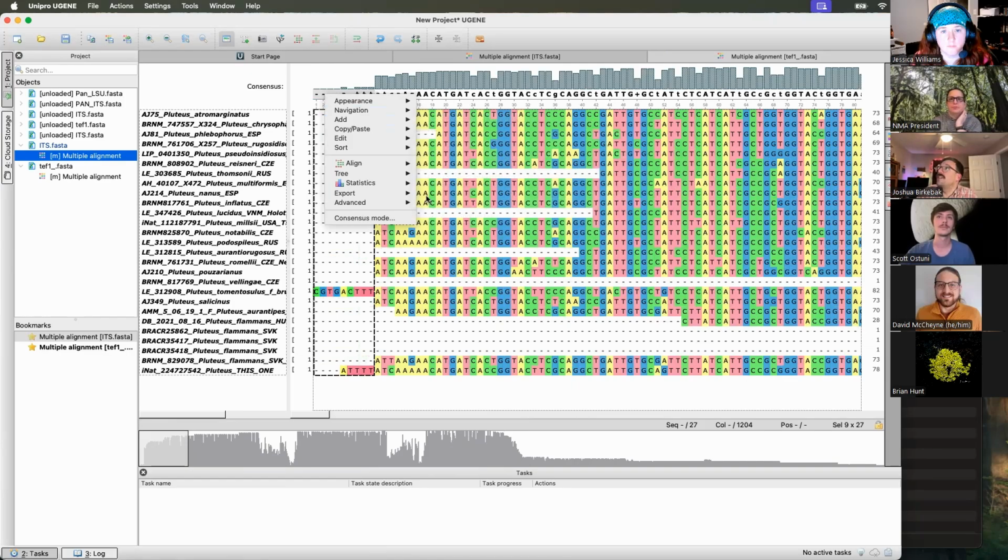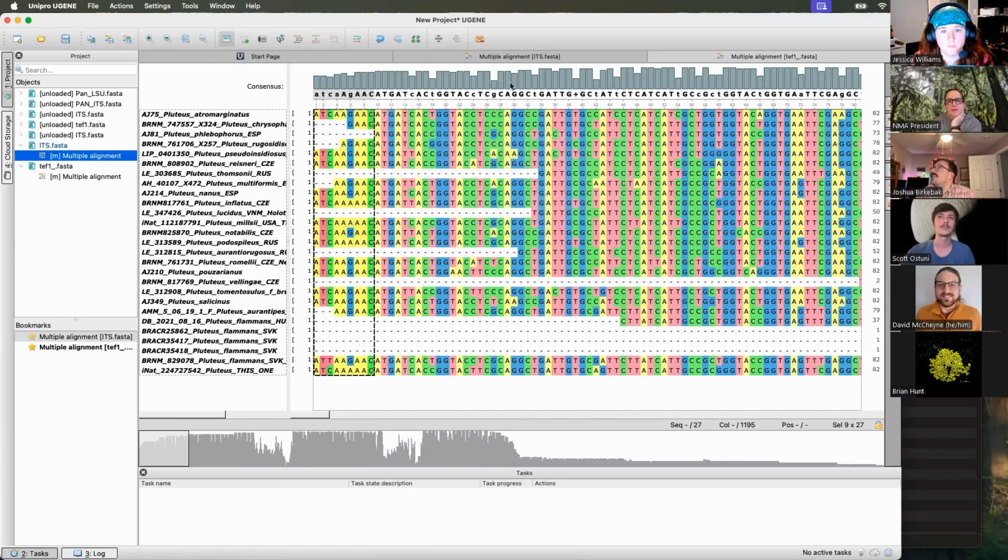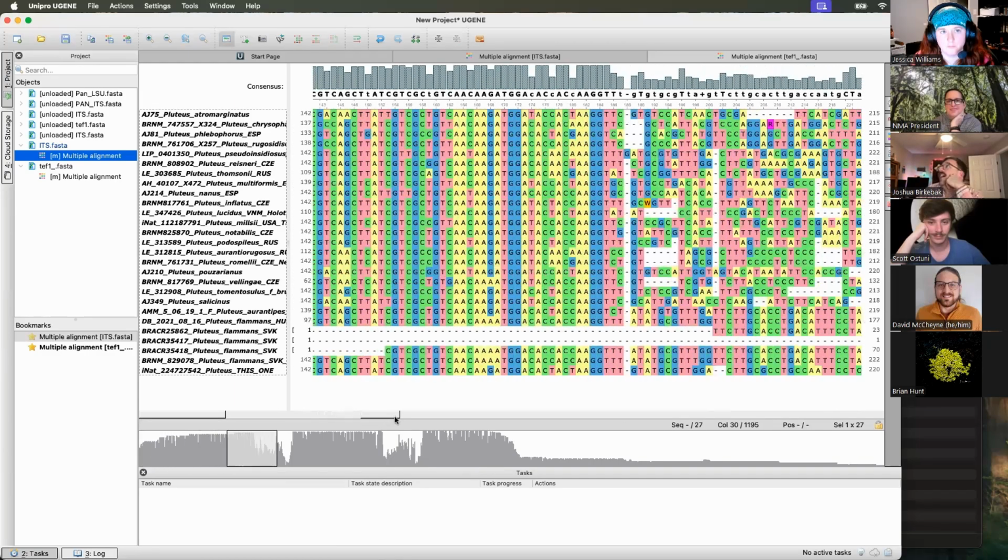Another thing that's nice with protein coding regions is you get to see the genetic code at work, where you could very easily see your first, second, and third codon positions. You've got your first, the most highly conserved, your second, which is only slightly less conserved, and then your third wobble position, right? And you can literally see this pattern of similar, similar, more different, similar, similar, more different. It's kind of nice to see that kind of stuff. Science is real.